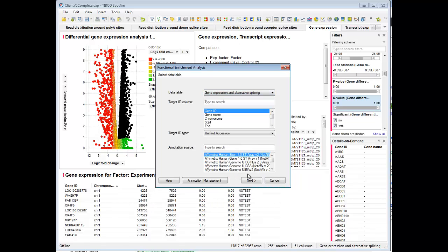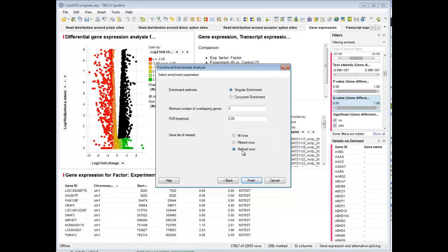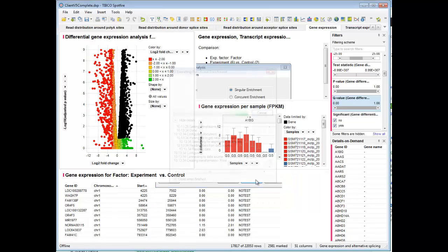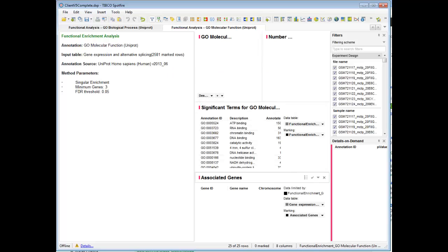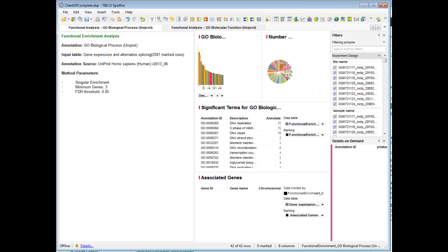The importance of easily obtaining this type of biologically relevant information cannot be underestimated, particularly now that we are facing an unprecedented avalanche of data where optimal analysis rather than data generation is increasingly becoming the bottleneck for many an experiment. By providing clear and interactive visualizations that help to identify and communicate the specific information, we are able to help the researcher speed up this analysis process.